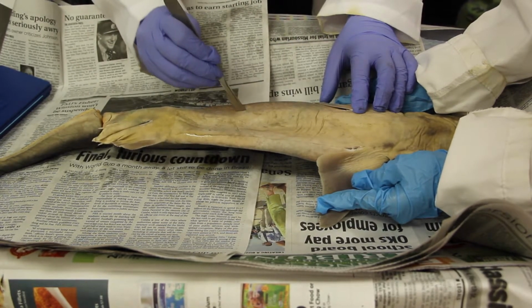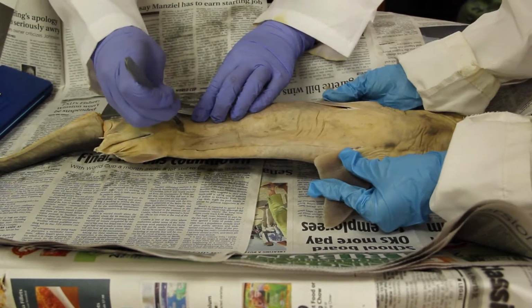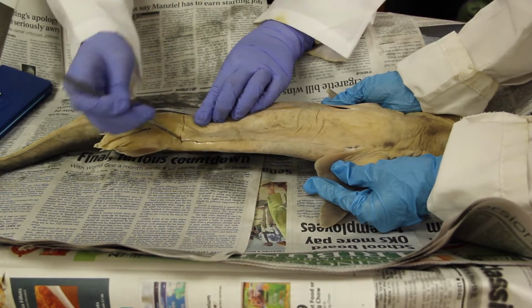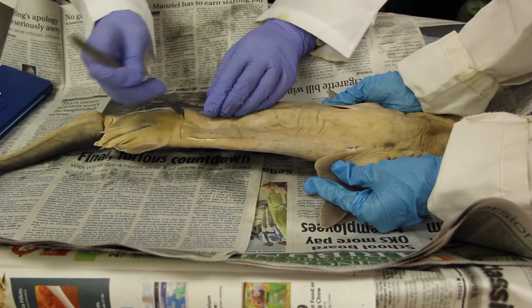The shark's organs are a little smushed inside just because they've been preserved and everything, so you just gotta be careful where you're cutting. Kind of like over here, you can see that there's something oozing out of the incision. That is just the liver oil. And liver oil is what helps sharks with their buoyancy in the water, so that helps them swim.